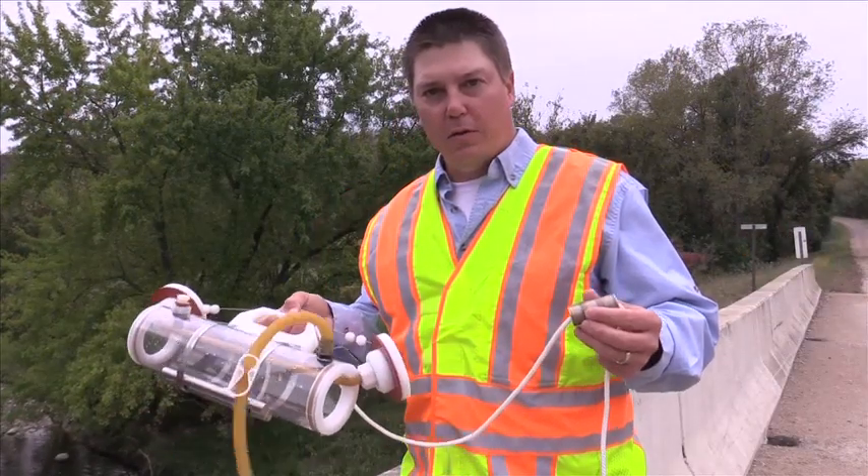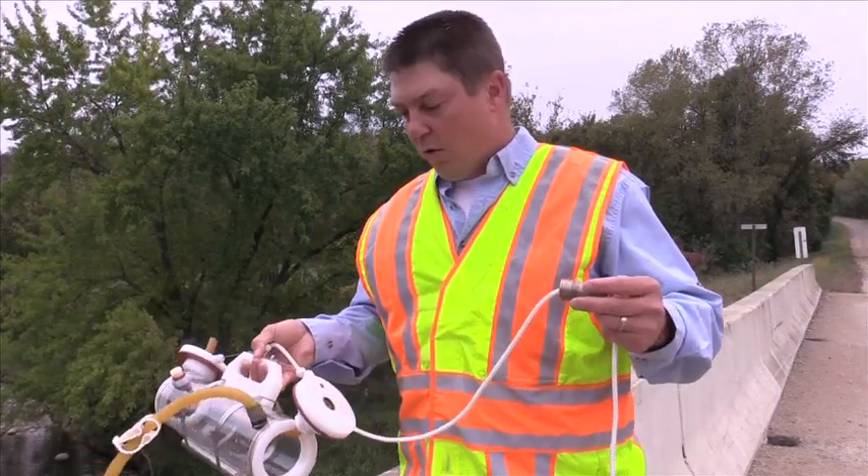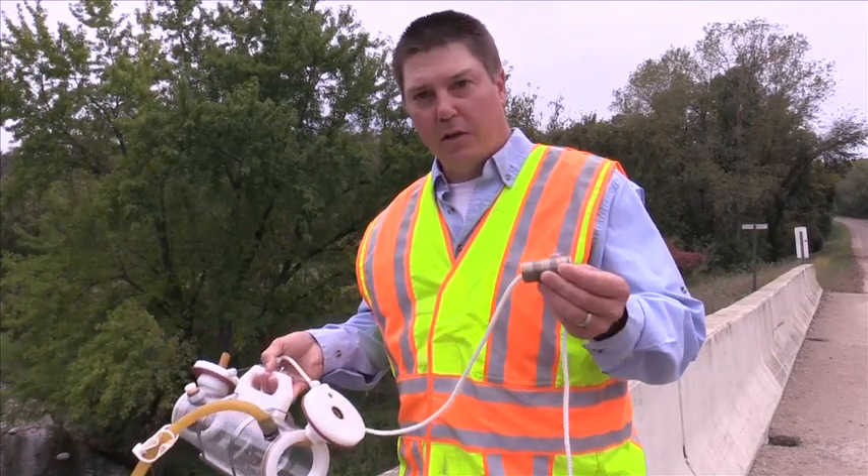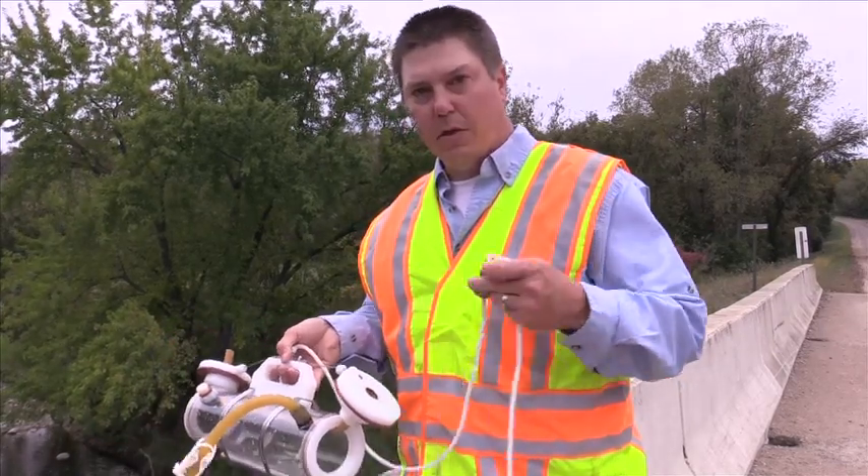Now we're going to lower the sampler into the water. When lowering it off the bridge, be sure you hold the messenger in your hand. This messenger is what's going to trip the sampler and collect the water.